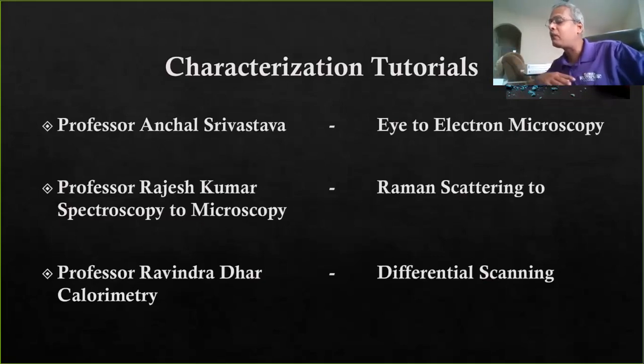You're taking it from one dimension to almost four or five dimensions in how to look at samples for different applications, in fact electrochromic applications, and many other things. So his micro-Raman facility is available for us to use, for the participants and panelists.